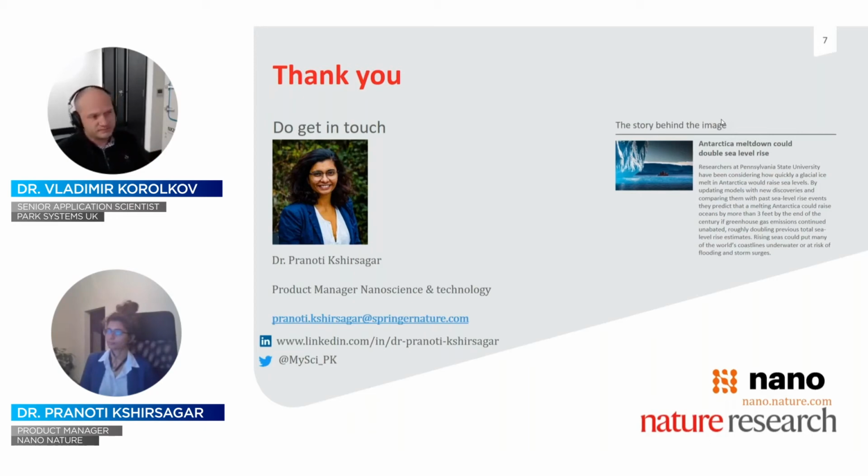But for other samples, indeed, the sample preparation could be quite tricky, and it largely depends on what sample you want to image and what information you want to get from the sample. But for Teflon, it is a remarkably easy system, and when you combine it with a low noise level atomic force microscope like this system, you can get those results relatively quickly and easily without any special preparation, really.